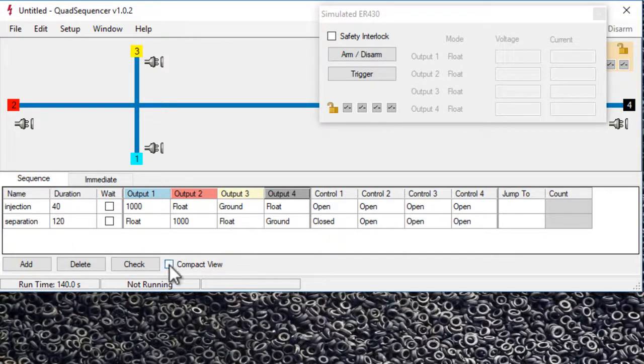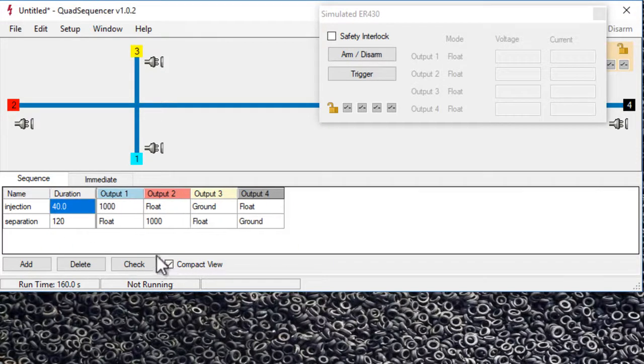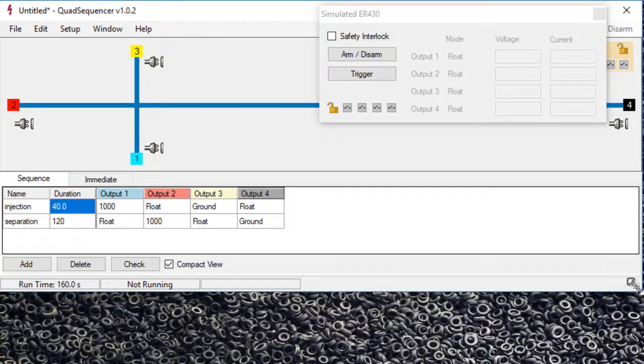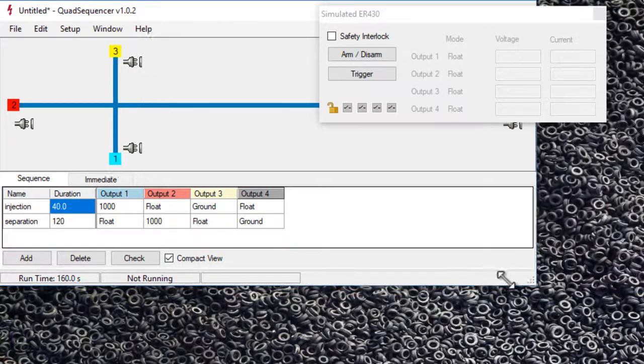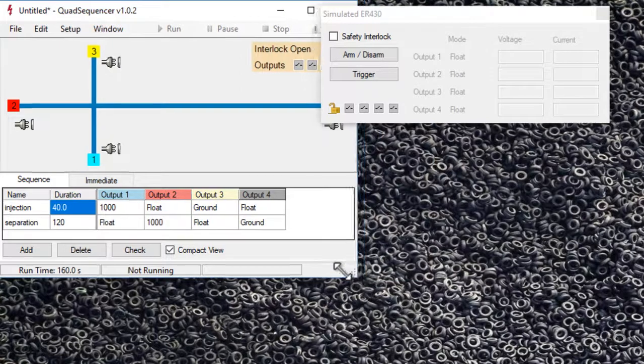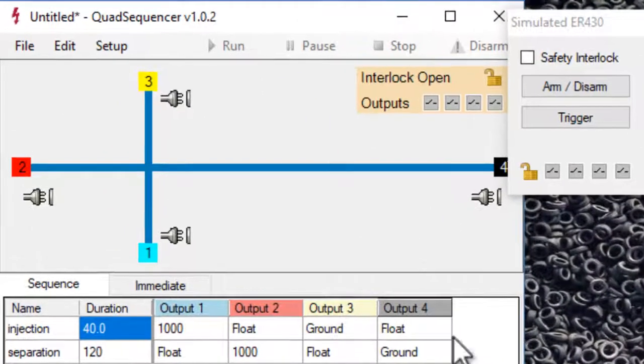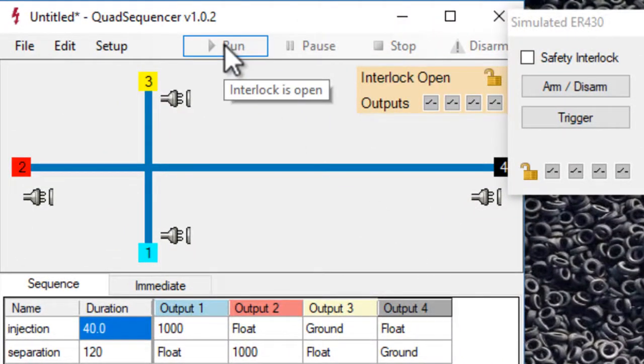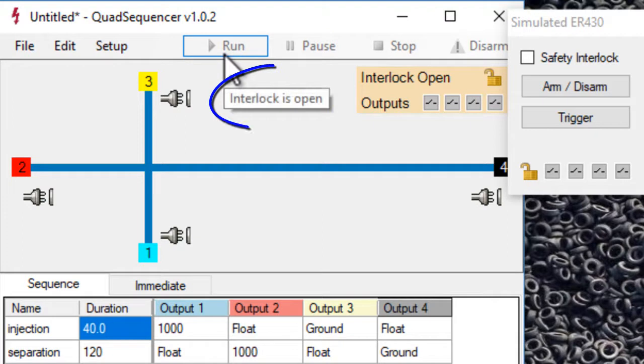We can click compact view so we just get our essential information. If we try to run the sequence now, it's going to tell us that the interlock is open.